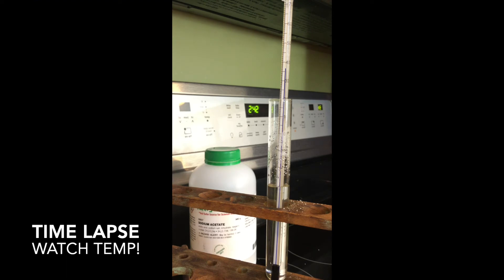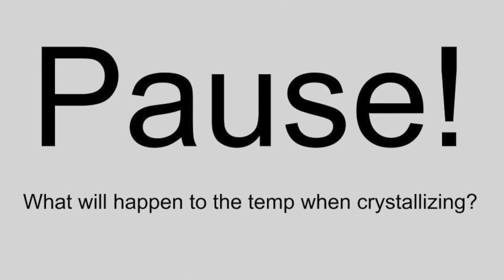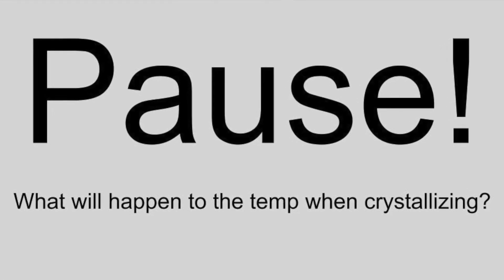So at this stage, this solution is supersaturated. It's holding more than it should. We have let it cool down for 23 minutes. And at this stage, I'm going to sprinkle in some seed crystals. What I need you to do is make a prediction. As it goes from liquid to solid when it crystallizes, what will happen to the temperature?